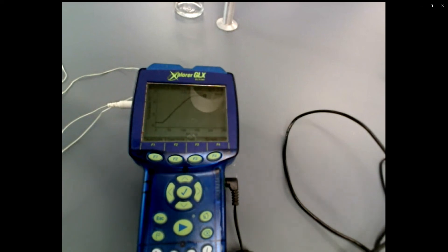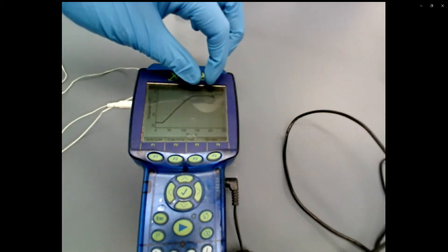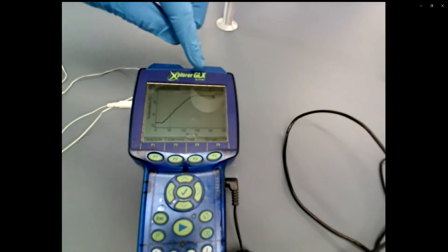And so that's all you're going to do in this experiment in terms of data collection. You'll need the masses of the vial, the masses with sodium hydroxide in it, the mass of the vial without sodium hydroxide in it, and then the volume of the solutions or liquids that you guys measure in the lab. And then the majority of the data is going to come from this little Pasco data logger blue device that's shown on the screen. So this graph is being displayed and it's recording temperature and time data.